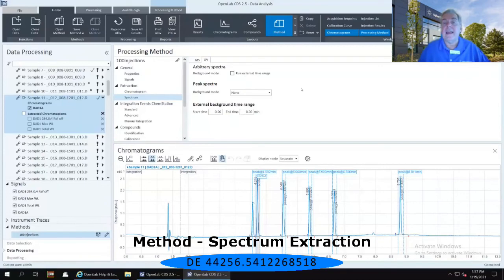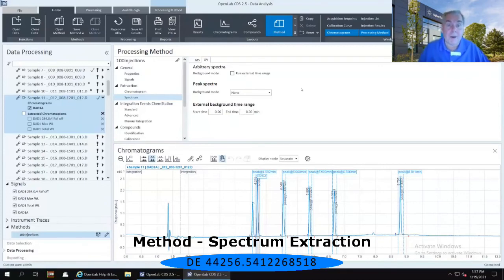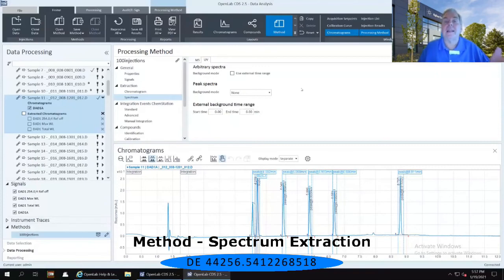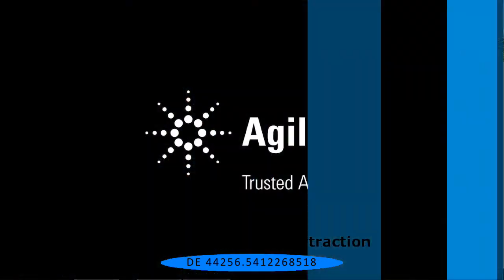And again, if you don't understand exactly how these work, simply selecting that F1 button allows you to get help and learning on exactly what these spectral subtractions will do.